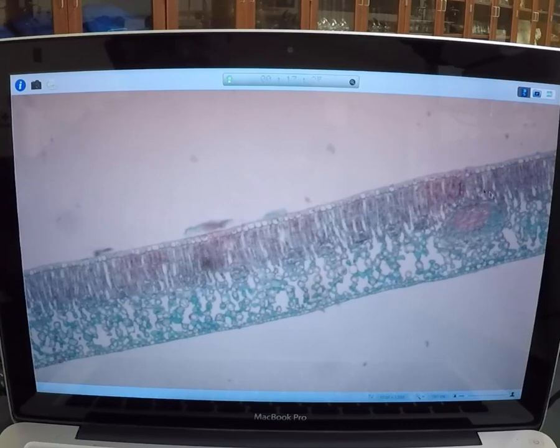You can see a big xylem, phloem, kind of vascular region there, and there's some smaller ones throughout. But this top faint pink line is the cuticle layer, sometimes called the epicuticle layer because it occurs next to the epidermis. That's the waterproofing layer. Then these clear cells are the epidermis.